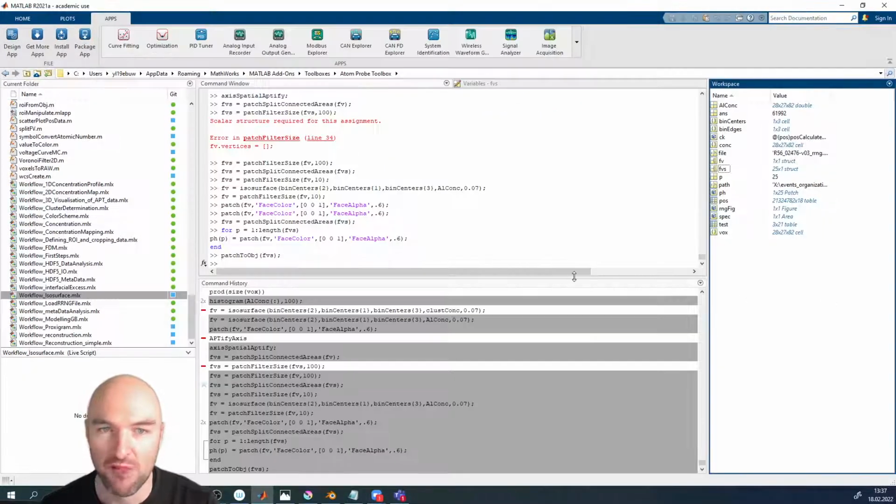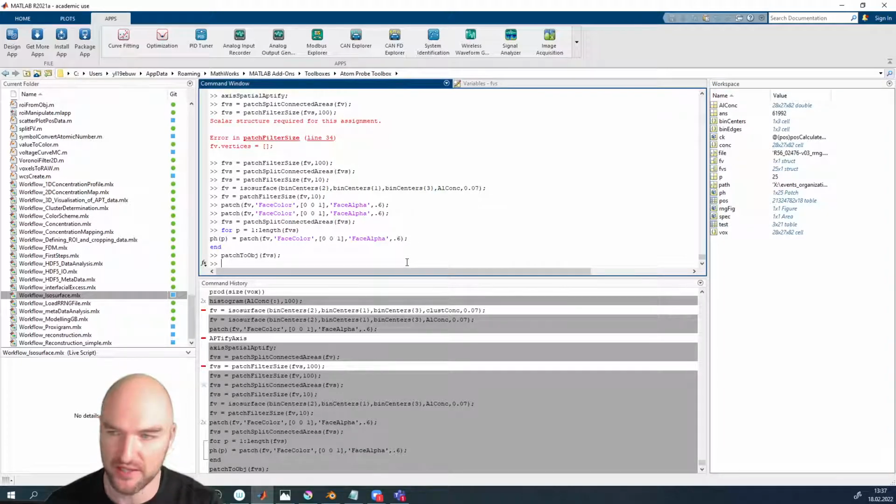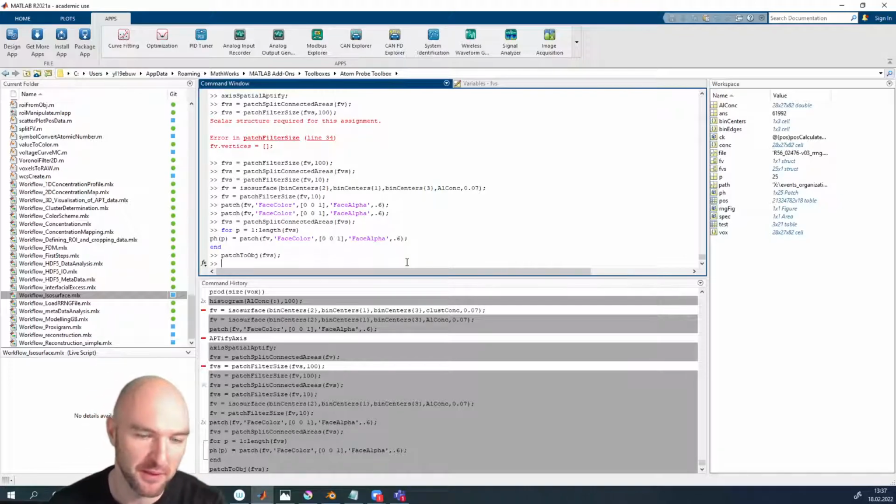So the question now is, we can make proximity histograms relative to 0D, 1D, 2D objects. Obviously, relative to 3D objects, it doesn't make any sense in 3D. We could do it in 4D, if you've got some time series, not in atom probe, but maybe in synchrotron tomography, where you have time series, you can do a proxigram in 3D.